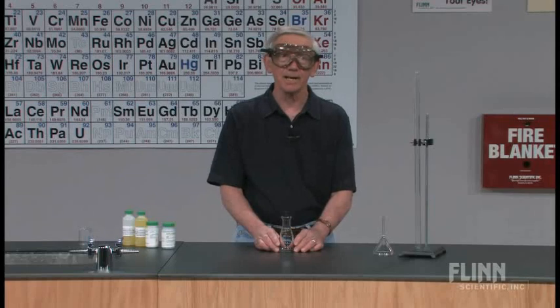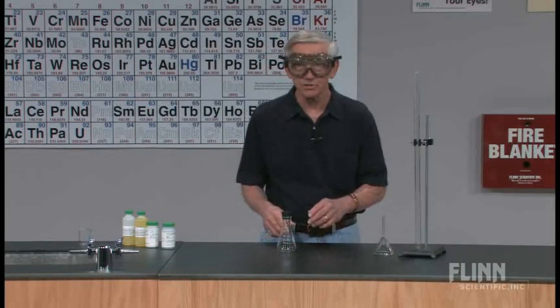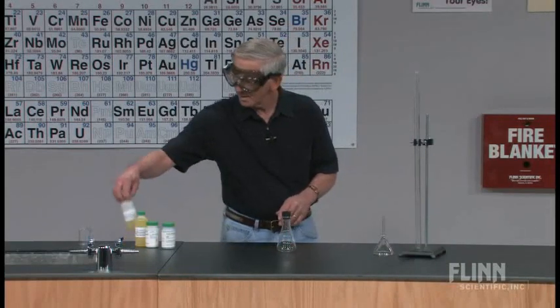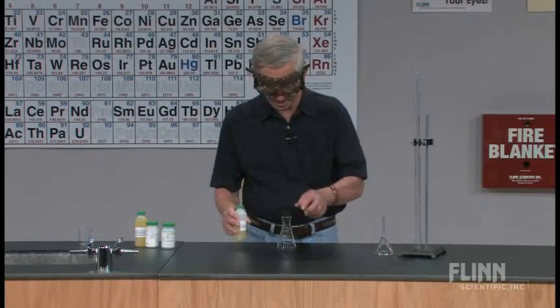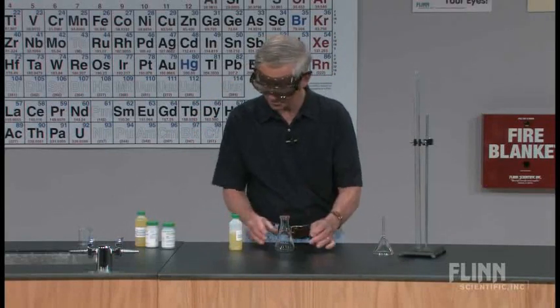It has to do with vanadium and the multiple oxidation states of vanadium. Here's vanadium in the 5 plus state. Let me put some in the flask, it'll be easier to see.